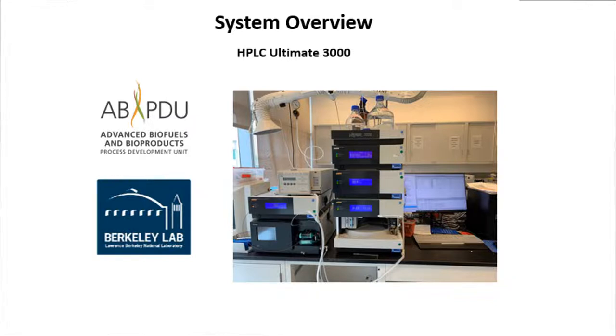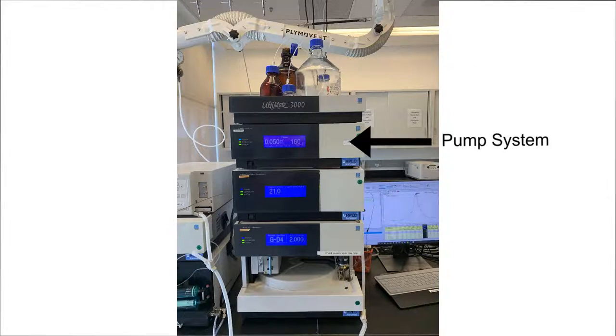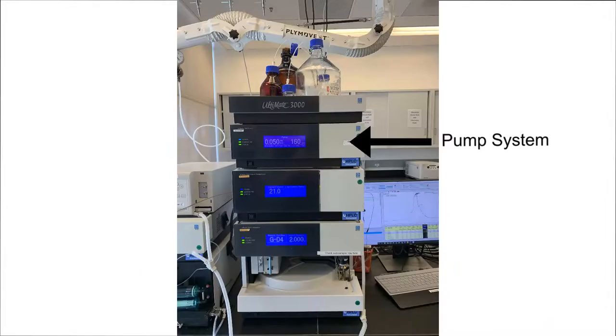To start, we must describe the system overall. Atop the HPLC system sits the eluent, or mobile phase. Next is the pump system. The pump system drives eluent throughout compartments of the HPLC, from the eluent bottle, through the degasser, the pump itself, then to the autosampler, to the column, and finally to the detectors.